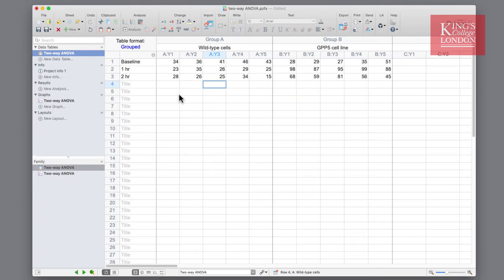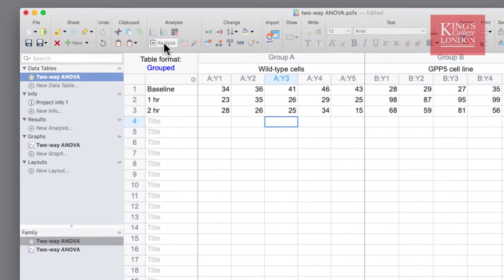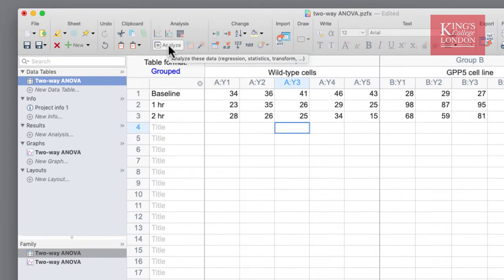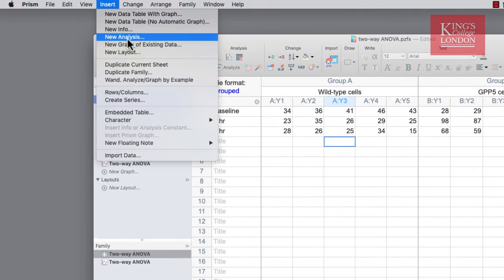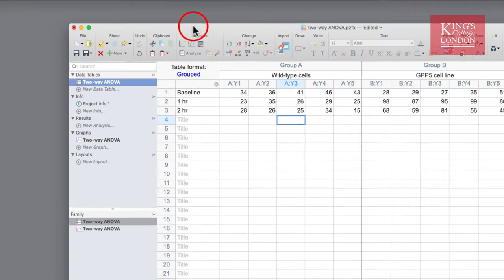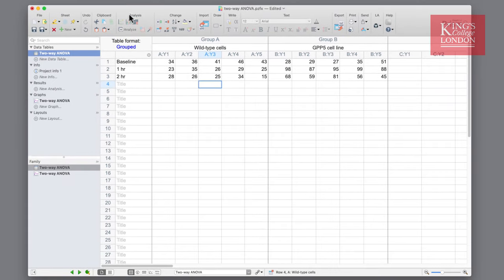You can carry out a two-way ANOVA by three different means: either clicking on the Analyze button in the menu bar, choosing new analysis from the results panel of the navigation pane, or by choosing Insert New Analysis from the menu. In this case we will click on Analyze on the menu bar.